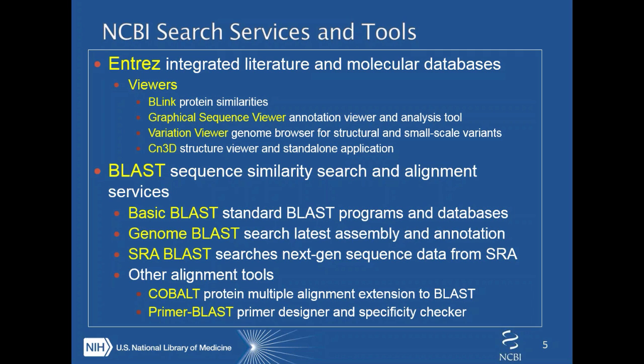BLAST is our sequence similarity search tool, and it searches all of the DNA sequences and protein sequences at NCBI. There are a number of different services that are listed for you here. I'll mention using Genome BLAST today during my talk. We'll also use Primer BLAST to design some primers for the exons of the gene. And I think Ben is going to do a little demonstration with SRA BLAST during his portion of the talk.